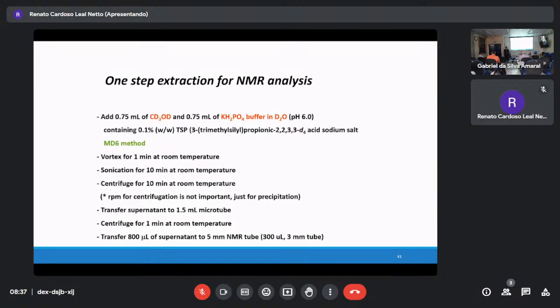There is a limitation on the number of metabolites, even with mass spectrometry, you have a limited set of metabolites that can be extracted and detected. There are 30,000 chemicals; NMR probably detects 20 or 30, maximum 100; mass spectrometry maybe 200-something compounds. How can you be sure? You identify only 1 or 2% of metabolites, but you claim you are doing all metabolites. It doesn't make any sense.